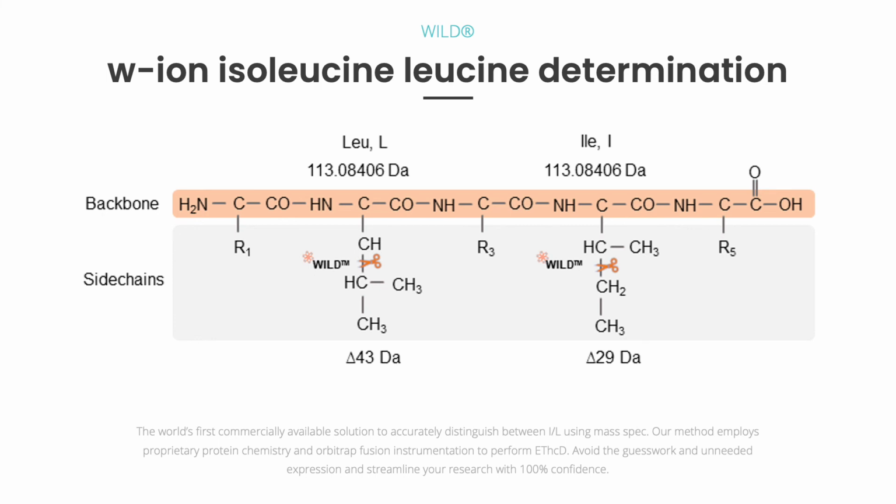Traditional approaches here are going to be more frequently looking for germline sequences from which they can look at residues. They are going to rely on different digestion rules, but neither of these approaches are truly de novo. And when we're regularly seeing 5 isoleucines or leucines in the CDRs, the accuracy becomes incredibly important. We want to have every single residue confirmed based off of data rather than our best guess.